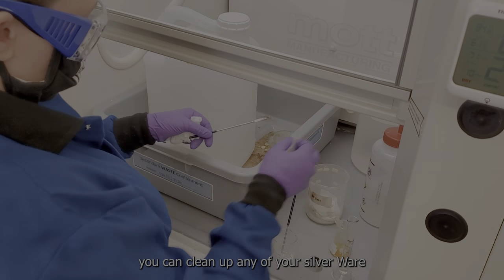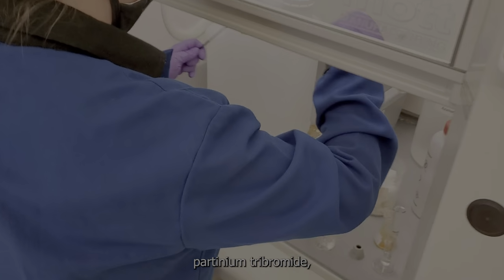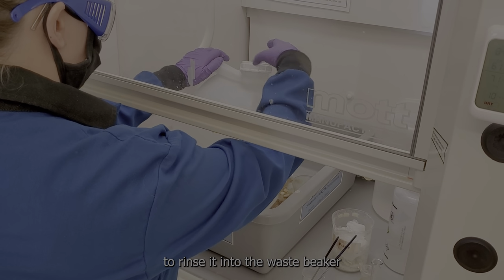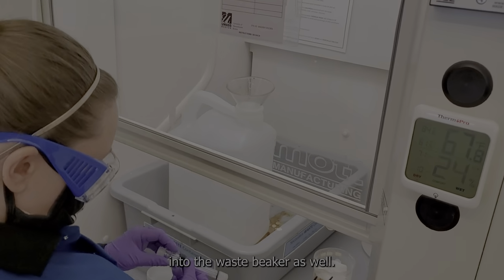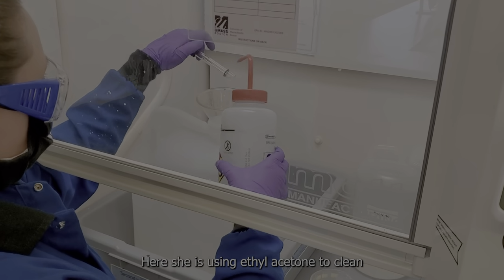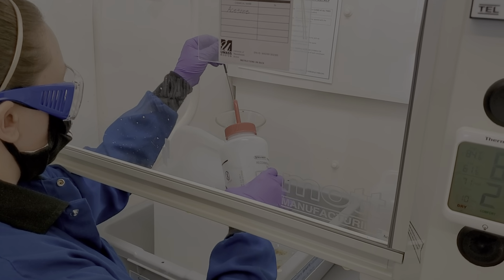Once that's done, you can clean up any of your silverware or spatula. Here, notice there's still some pyridinium tribromide. So Tara will use some methanol to rinse it into the waste beaker, and any extra ethanol that she has will be poured into the waste beaker as well. Here, she's using acetone to clean all the glassware that she used today.